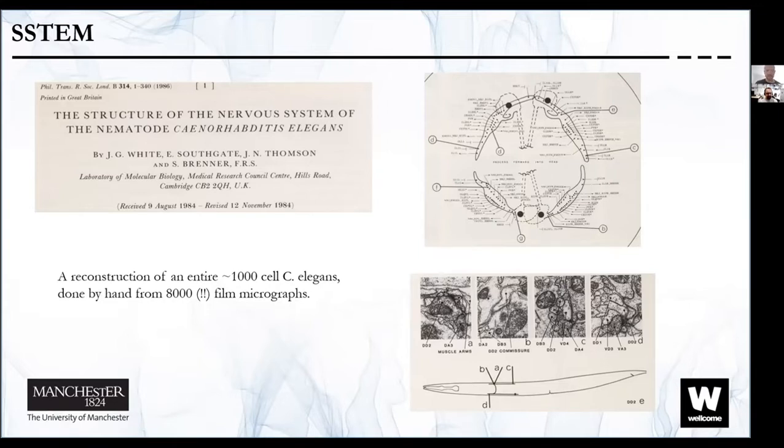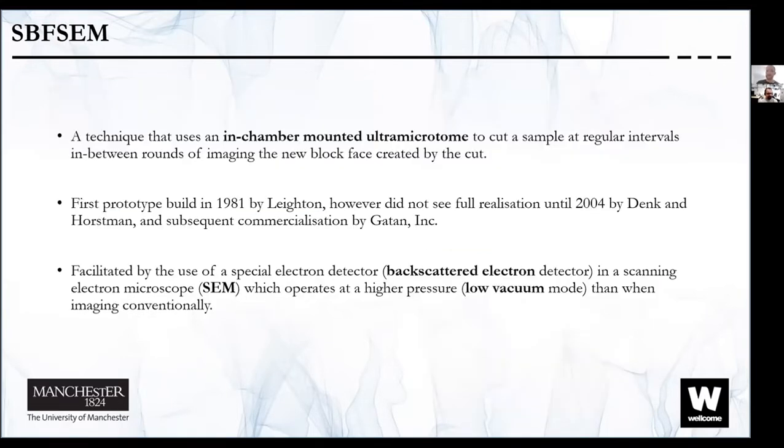Because of the techniques that we'll introduce today that are a lot more modern and up to date, and all of them are easier to do. So the first one that we'll talk about is serial block face scanning electron microscopy.